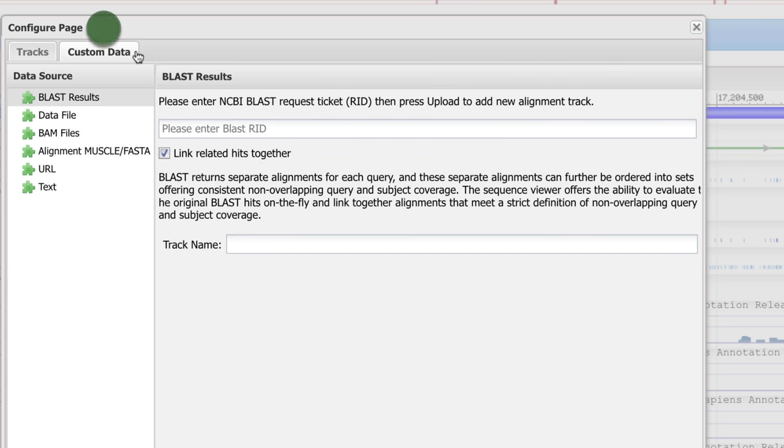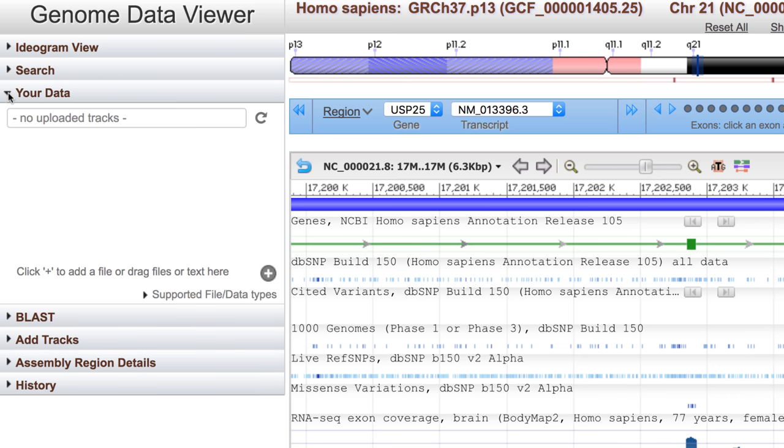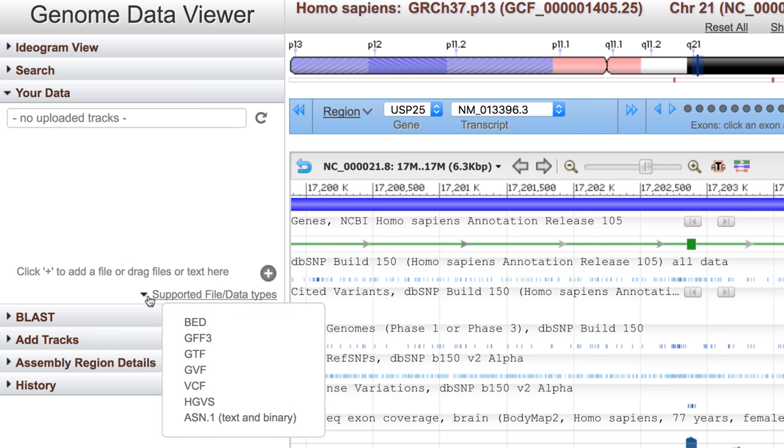And don't forget that you can upload your own data, either here, or use the Your Data widget on the left to add a track of aligned data from a file on your local machine or at a URL.